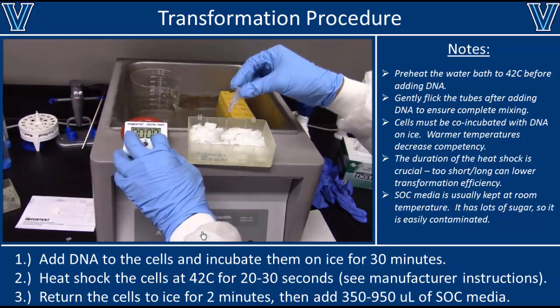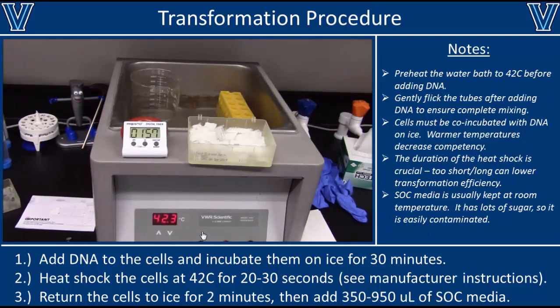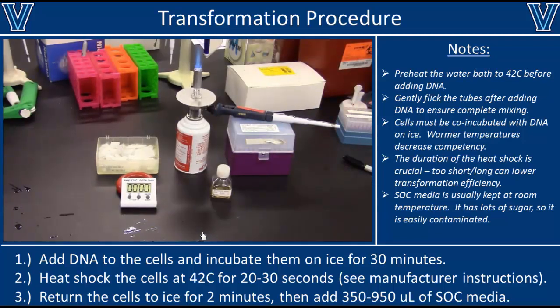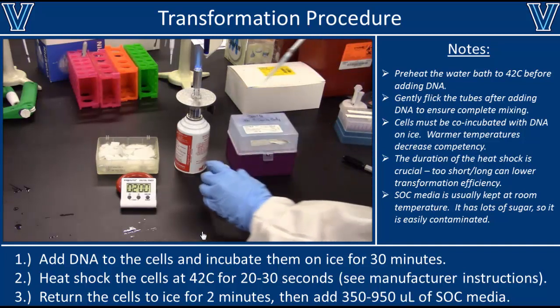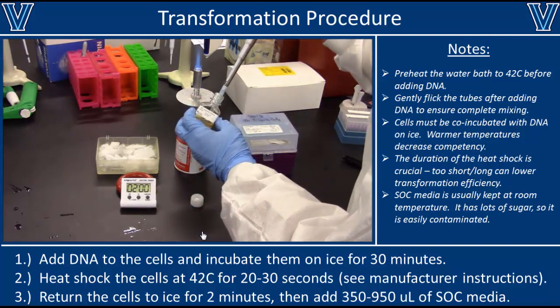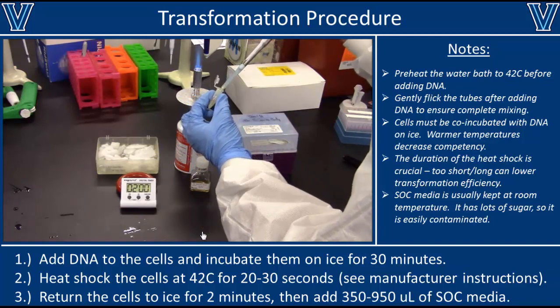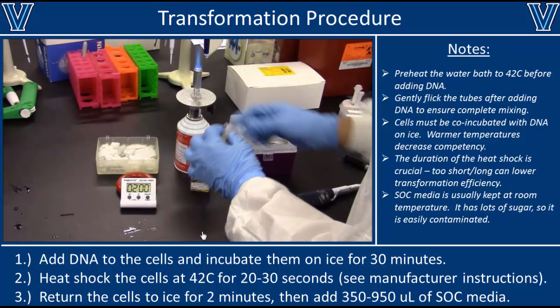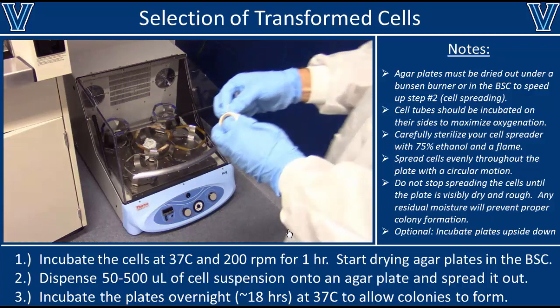Once your heat shock is done, place the cells back on ice for two minutes to help them recover. Then bring the cells back to the sterile bench and add 300 to 900 microliters of sterile SOC media to each cell aliquot. This SOC media is rich in nutrients and sugars which helps the cells recover; however it's also very easy to contaminate. SOC is usually kept at room temperature so you can see any contamination — always give it a quick shake to check if it's turbid. In a pinch, if your SOC media is contaminated, you can use LB media, but transformation efficiency may decrease.